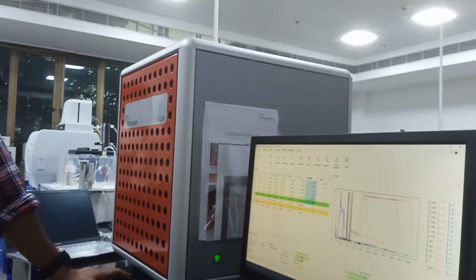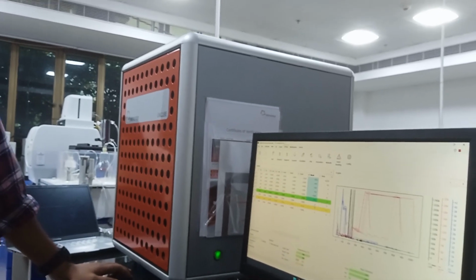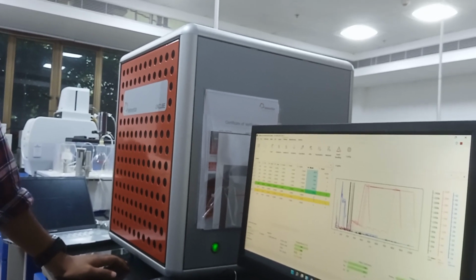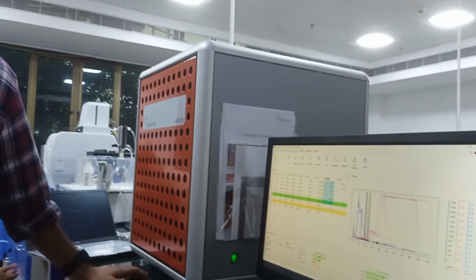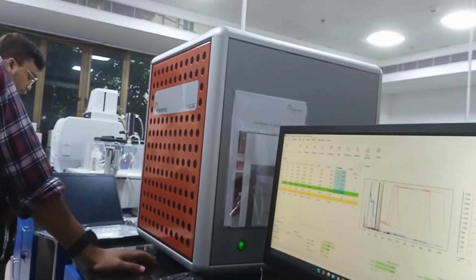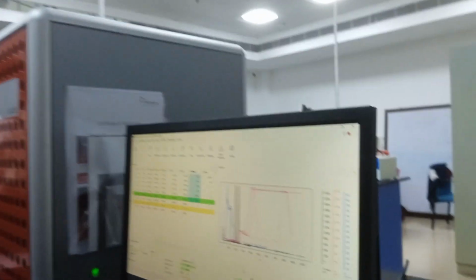The blank should be less than 500 as per our recommendation. To achieve that, you have to get a high purity gas. I don't know who the high purity supplier is here, but in our place it will be a Baruka cylinder. I am pretty sure you will get it below 100.